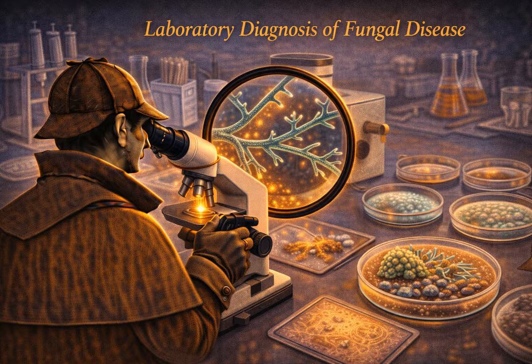Murray lists a whole toolkit of stains here. I want to go through these, but I want to focus on the why for you listening. Why do we need so many different ways to look at a slide? Let's start with the most basic one. KOH, potassium hydroxide. I've heard this called the clearing agent. That's the perfect name for it.